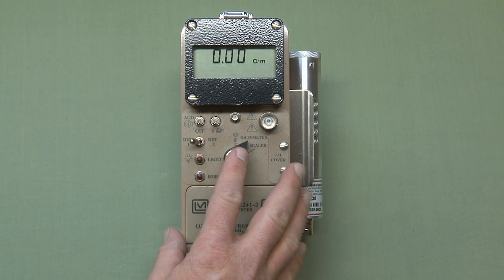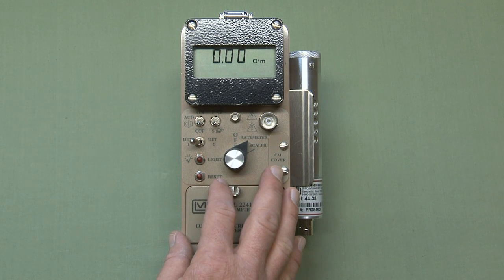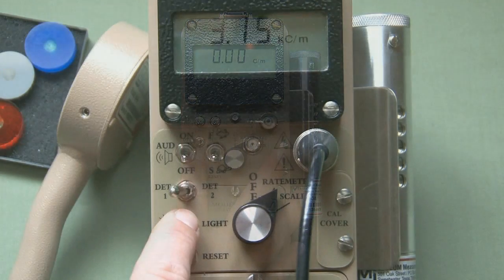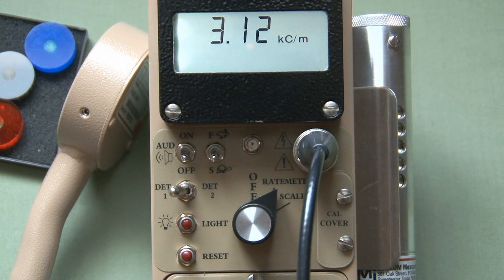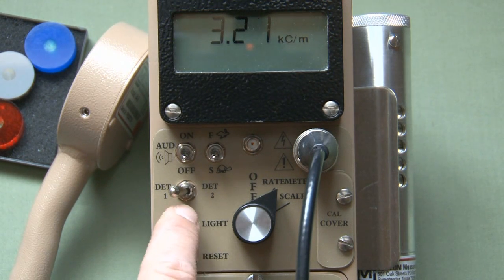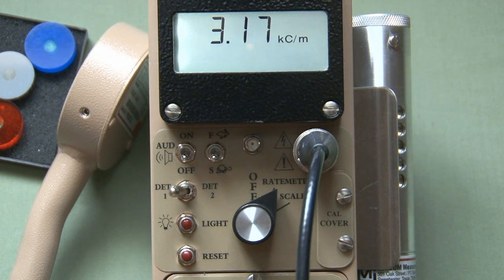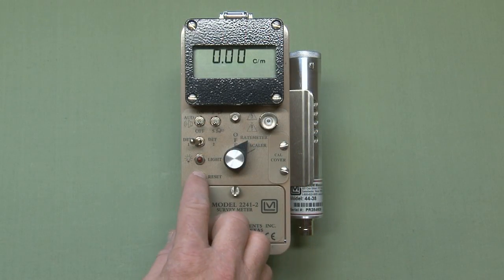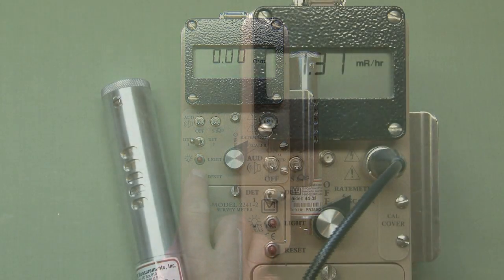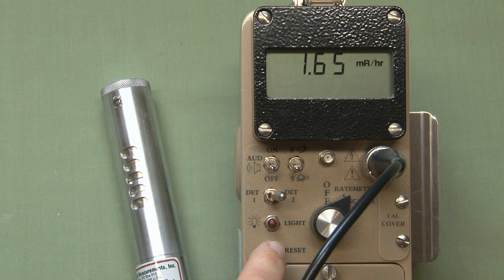There are two red buttons on the instrument. The first is labeled 'light' — when depressed once, the backlight comes on for a preset period of time, five seconds in this case. The backlight is programmable from five seconds up to 240 seconds. The reset button is used to zero the display or acknowledge an alert or alarm condition — pushing it once will zero the instrument out.